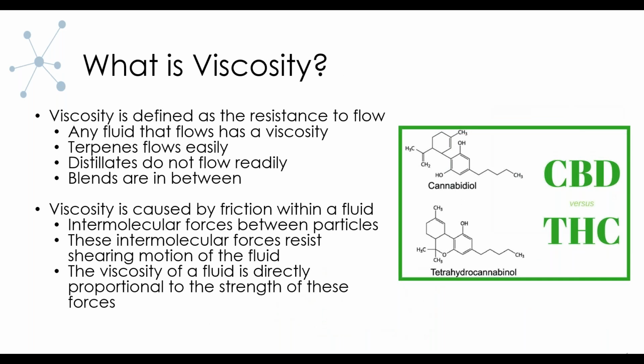And so what is viscosity? Viscosity in its simplest definition is resistance to flow. However, any fluid that flows has viscosity. For example, in the cannabis industry, terpenes flow very easily, so obviously they have much lower viscosity compared to distillates, which are very high in viscosity and don't flow very easily. And when you mix terpenes and distillates, you get a blend, and that's usually somewhere in between.